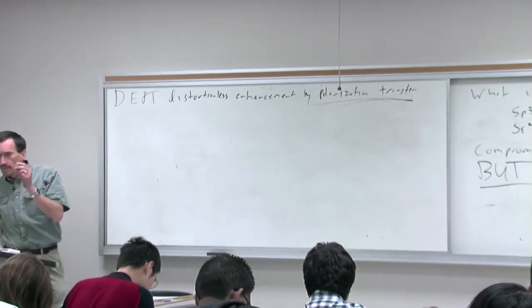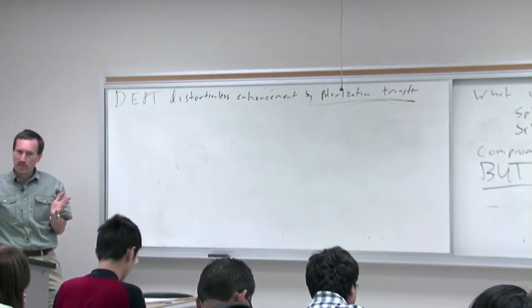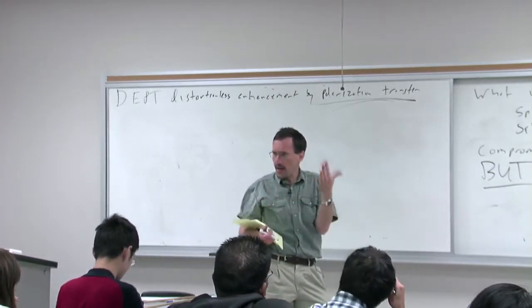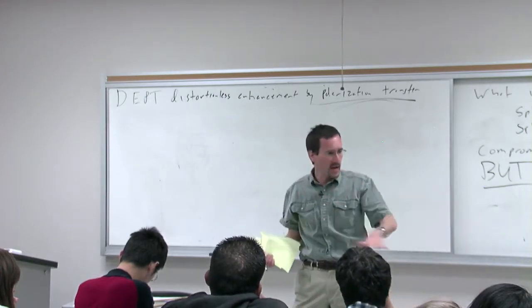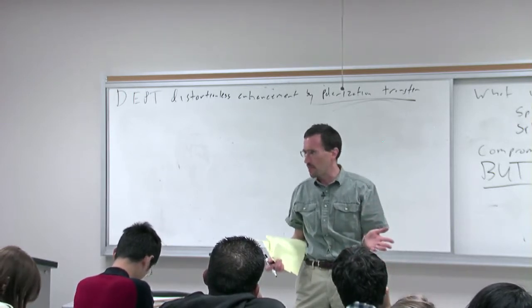Remember, carbon has 1/4 the magnetogyric ratio of proton, which means the Boltzmann differential in population is about 1/4 as big for carbon as it is for proton. Carbon is a very insensitive experiment. You've got 1% C13, 99% C12, which is spin inactive. There's nothing you can do about that.